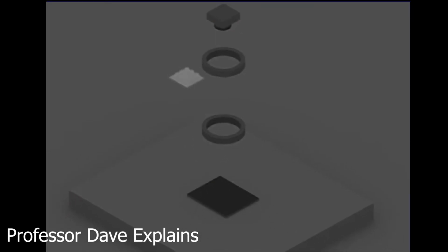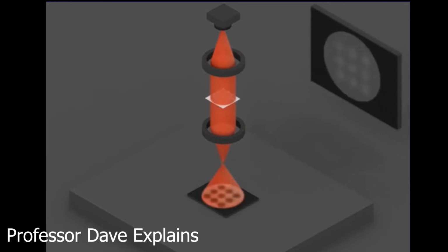Electrons from the electron gun travel through a vacuum in the column of the microscope. The electrons are focused by multiple condensers and pass through the sample, which then impact a detector. The path of light for CLM can be traced starting with the light source, whose light is focused by the condenser towards the sample or specimen. Eventually, this same light then is received by the objective lens, which allows the image of the sample to be magnified.